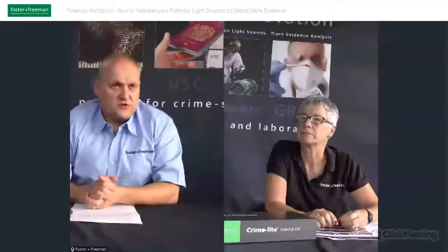The bandpass filters. Yeah, or a bandpass filter. That's a very good point, because most filters are actually long pass filters, but the Auto actually contains 2 different bandpass filters, which are specific for body fluid examinations, which can be really useful in some cases as well.